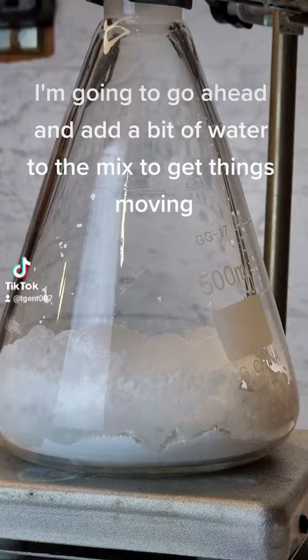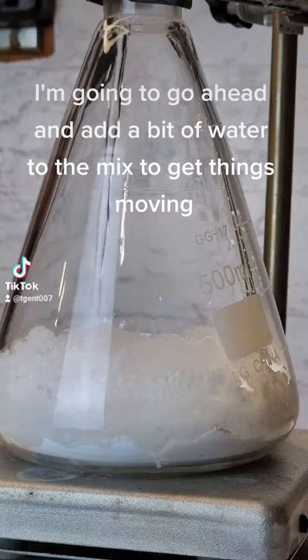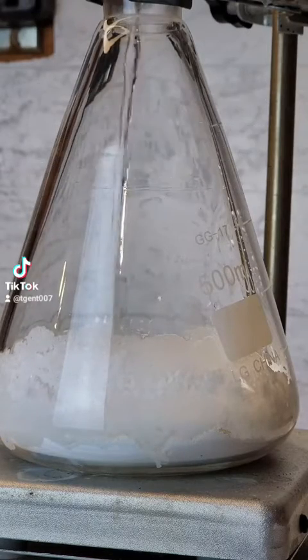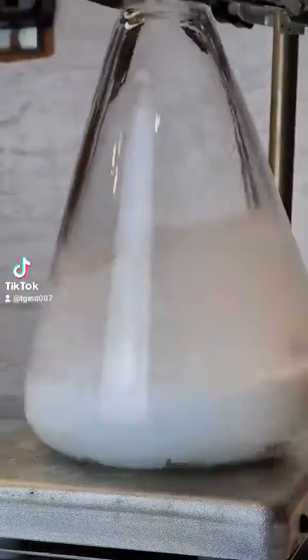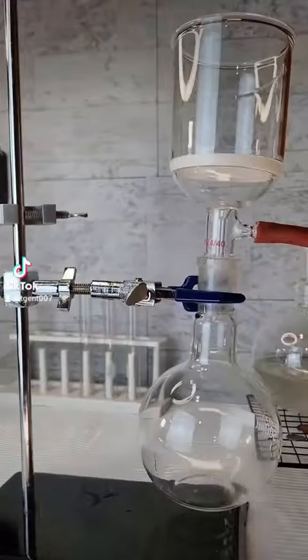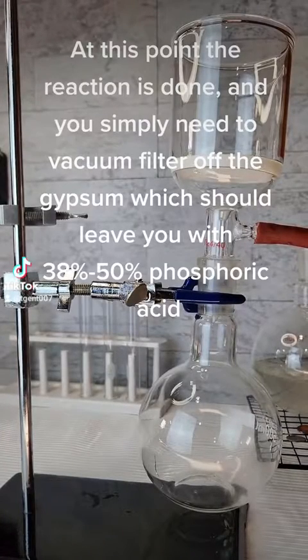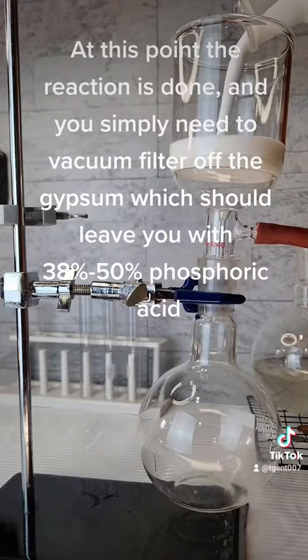I'm going to go ahead and add a bit of water to the mix to get things moving. At this point the reaction is done and you simply need to vacuum filter out the solids, leaving you with 38% to 50% phosphoric acid.